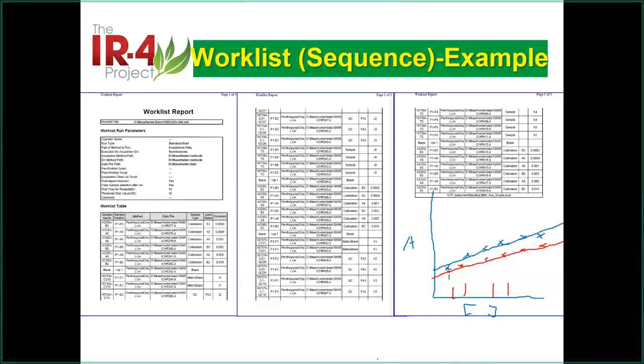Okay? So, yes, there is a requirement for how much difference is supposed to be. I would say in my lab, we put it there like plus or minus 15%, I believe. So it's equivalent to double injection. If your double injection is within 15%, you will accept that. And for the standard, most likely, if it is a spike well or a solvent, it should be less than that. Otherwise, that means you have carryover from the treated sample.